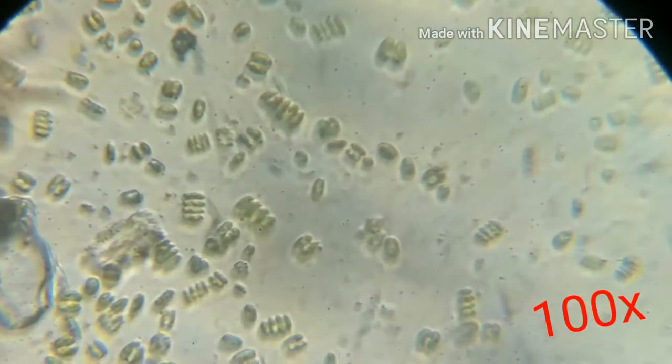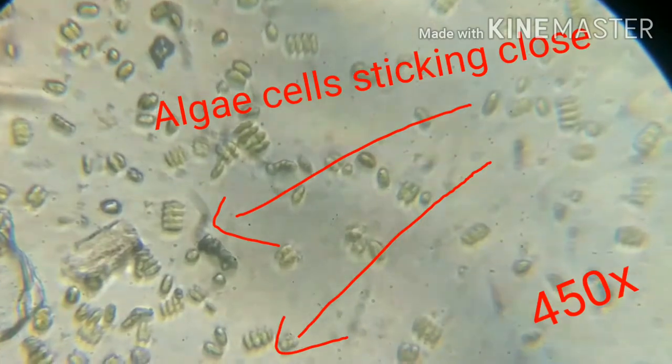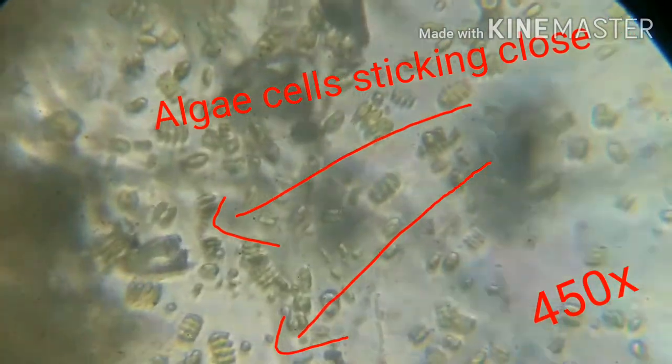I went on higher and we are able to look at the cells which are visible over there. I'm focusing close by in order to have a clear view, which are sticking close to each other.